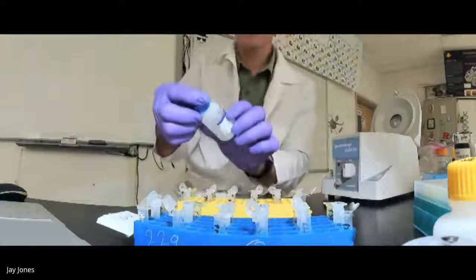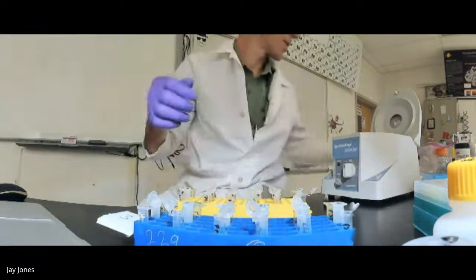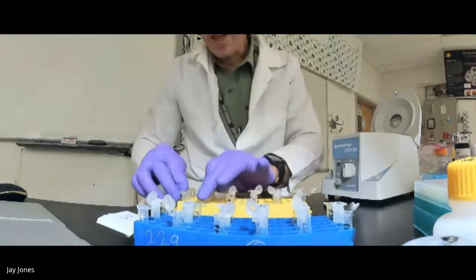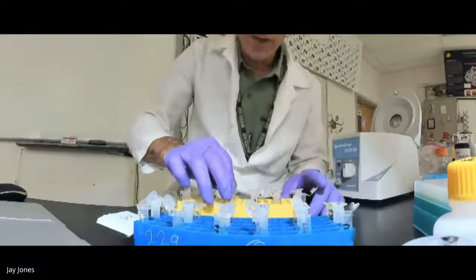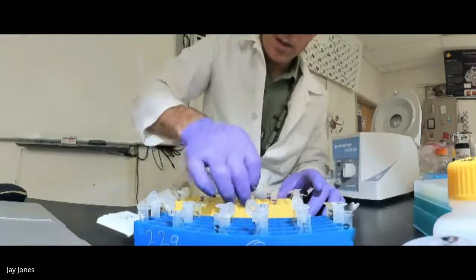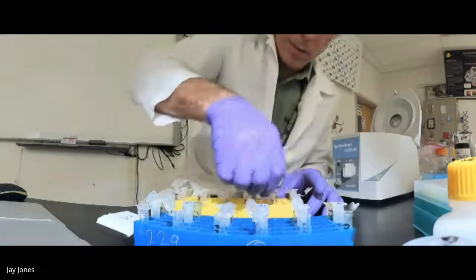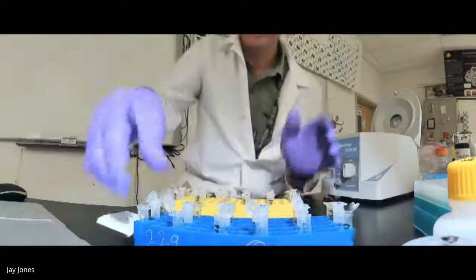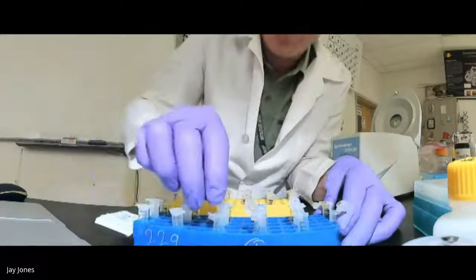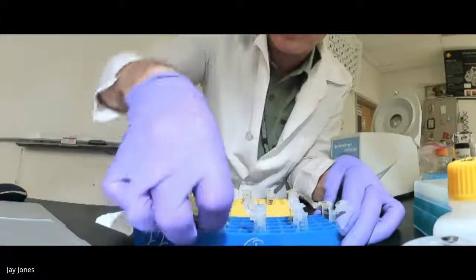That's solution three. I double check everything. Solution three, done. Solution three is an acid. The pH is going down from the alkaline pH that the soap loves, and we're going to bring the pH to somewhat neutral. So the soap doesn't work anymore. The soap will not work because we're adding H pluses.